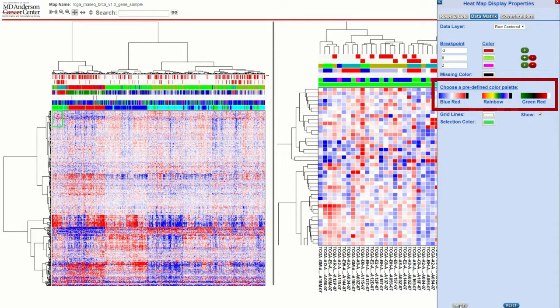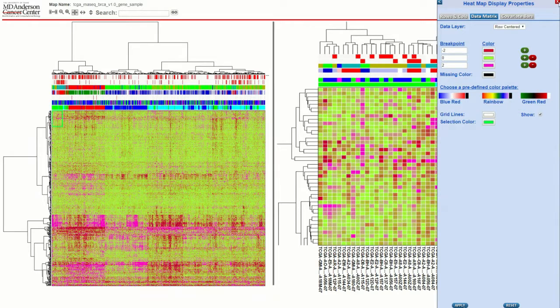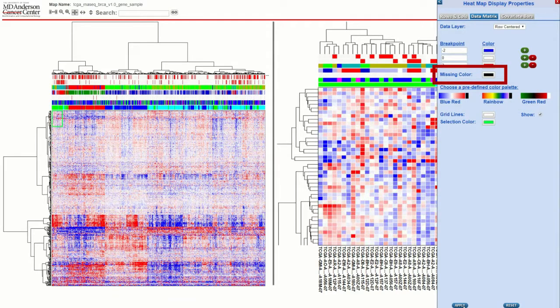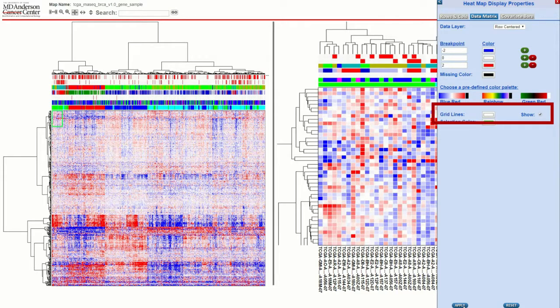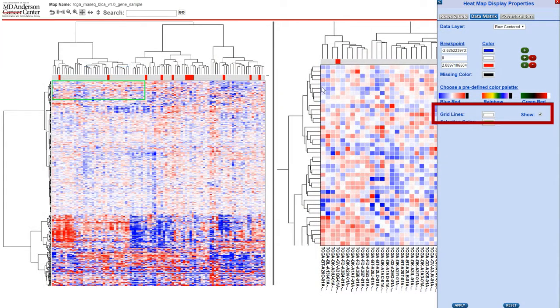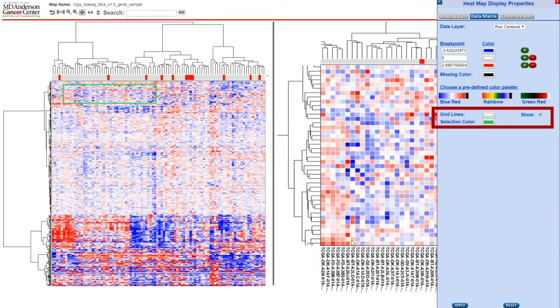Under that there is also a predefined color palette. Missing color is the color used for any missing data from the heatmap. In the detail panel, lines are drawn to separate data points where the zoom level permits. If you would prefer that the grid lines not be displayed, uncheck the show option.